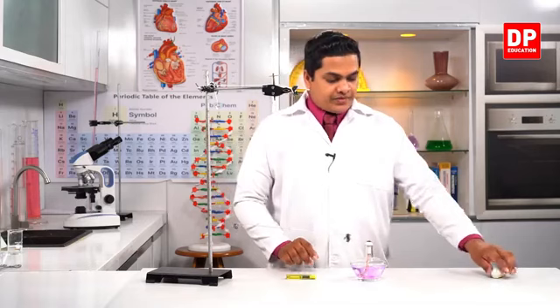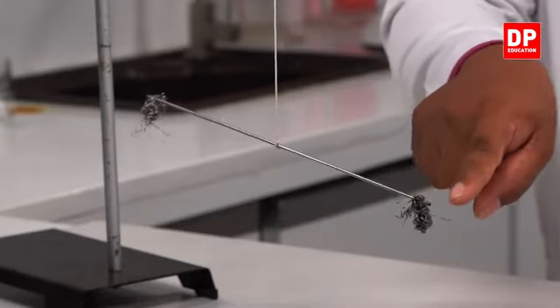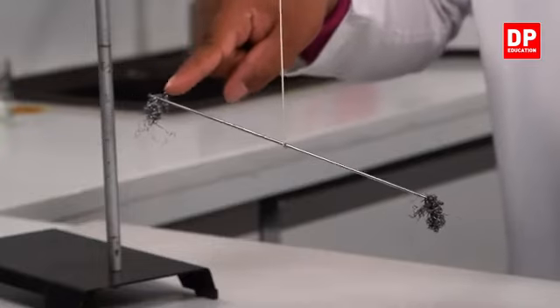Now here you can observe this end has a brownish black color. You can see it very clearly, and this other end has a shiny nature.